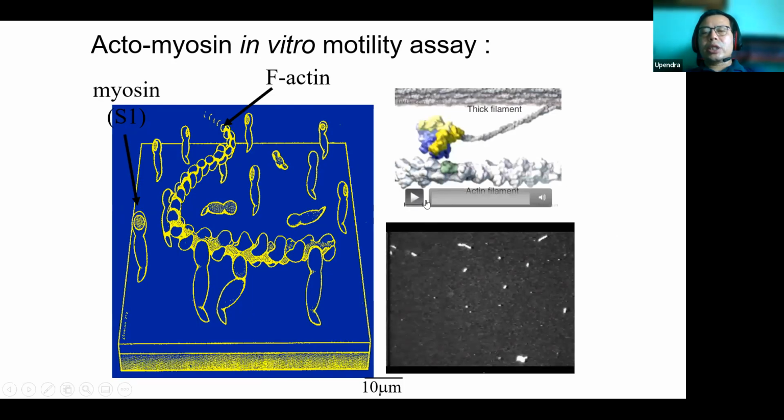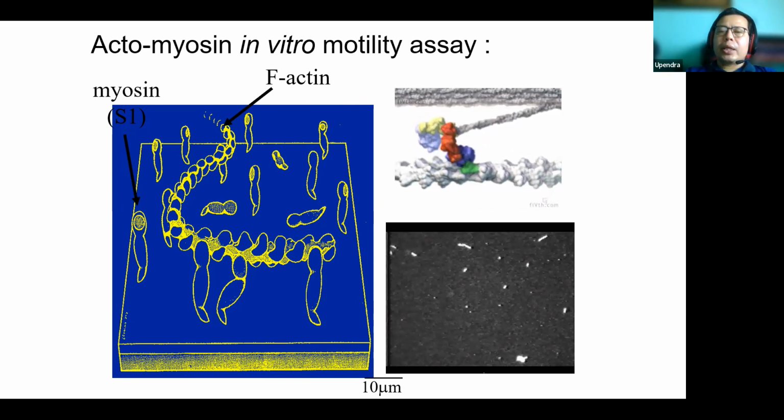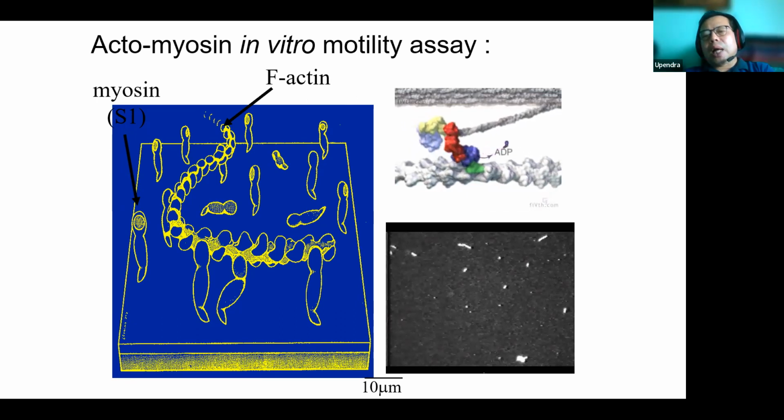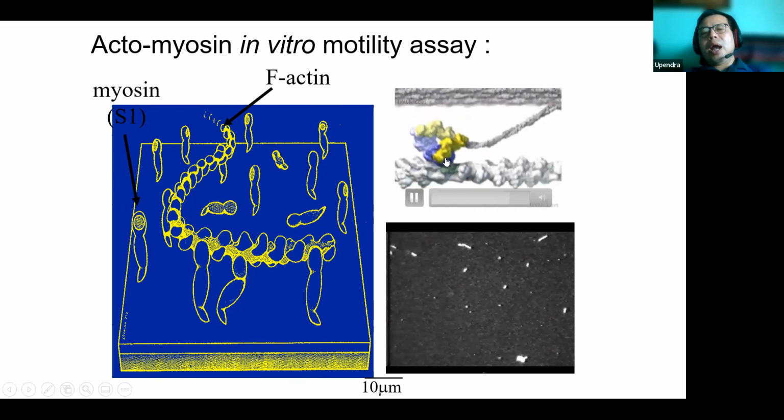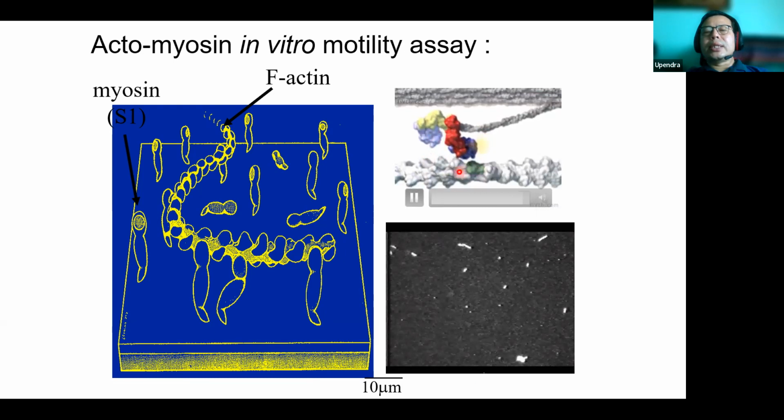You can see that this is possible, but this comes from the cryo-EM reassembled to make it as a movie like this. But this is exactly what I'm interested in: what happens in the in vivo condition. Look at the steps involved in muscle contraction. Every step is important. This is what I'm excited about, how to follow these steps so that we can intervene when somebody suffers from a disease condition.